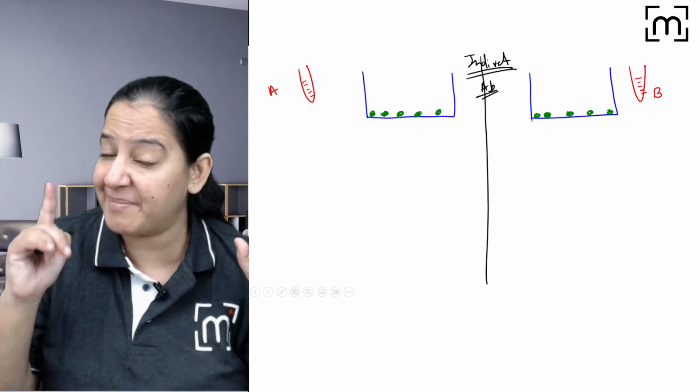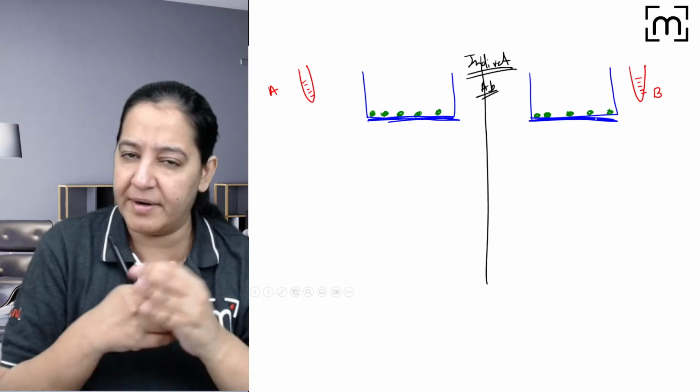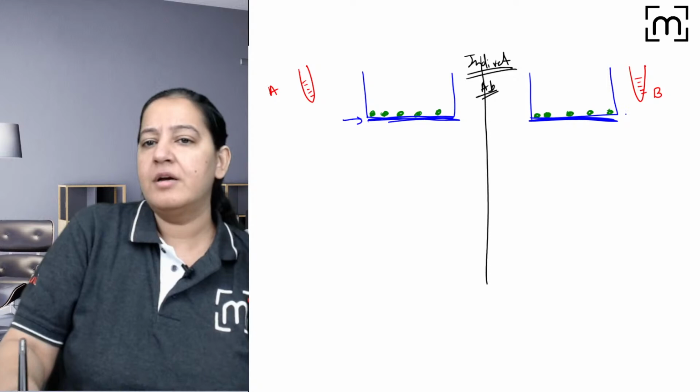External antigen we are putting. Now it is absorbed on the well, because of the immunosorbent material. Now step number 1 is over. So you put antigen here, you put antigen here. So step 1 is adding antigen, the external antigen.